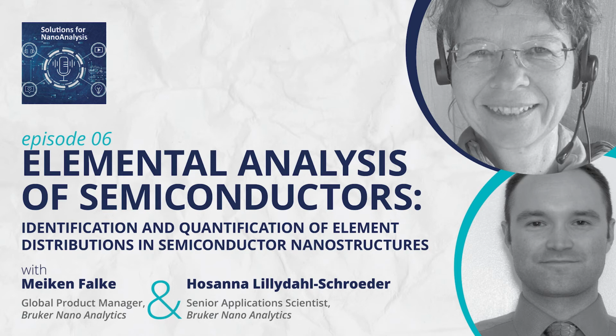Also, whole chips are getting delayered, and one looks at different levels, I guess more on the length scales of several tens or 100 nanometers and micrometers. And if we are talking whole wafers, then this is already centimeters. The scale goes from really large to very small, and I think before there sits micro XRF, then SEM and then TEM. So all of these microscopes have advantages, but let's stick with the TEM first.